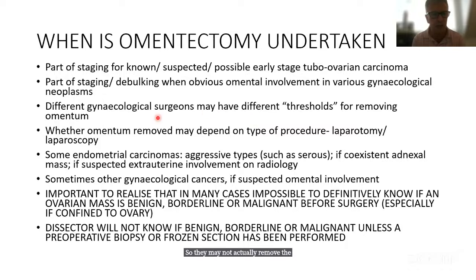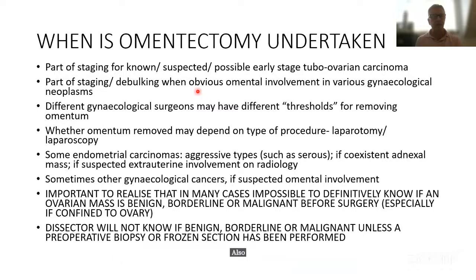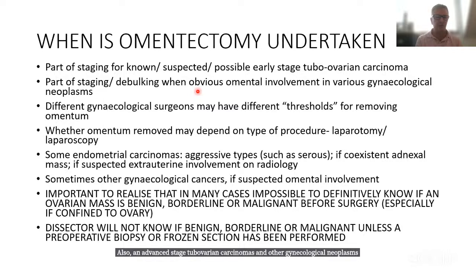It also depends to some extent whether the procedure is a laparotomy or a laparoscopy. But omentectomy is often performed for a known, suspected, or possible early stage tubo-ovarian carcinoma. Also, in advanced stage tubo-ovarian carcinomas and other gynecological neoplasms, when there's obvious omental involvement.